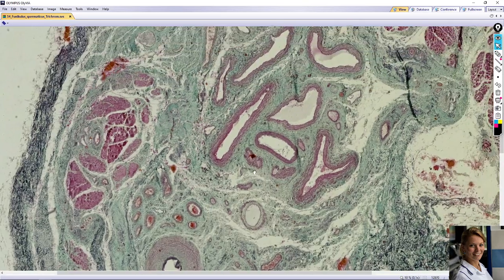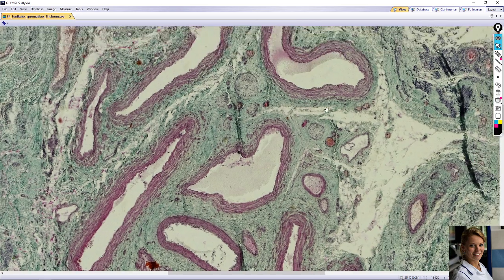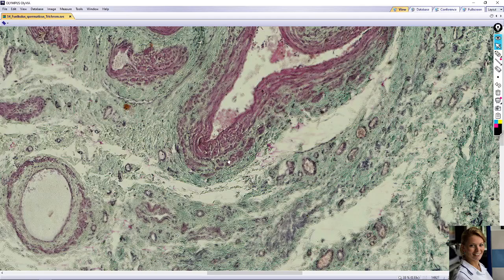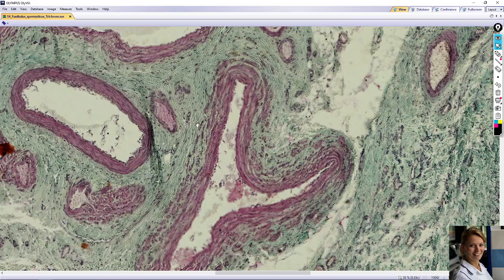And here you can see veins of the pampiniform plexus. This is a typical vein, and they resemble arteries and have bundles of longitudinal smooth muscle in the tunica adventitia. For example, here the longitudinal bundles in the adventitia of the veins of the pampiniform plexus are nicely visible.